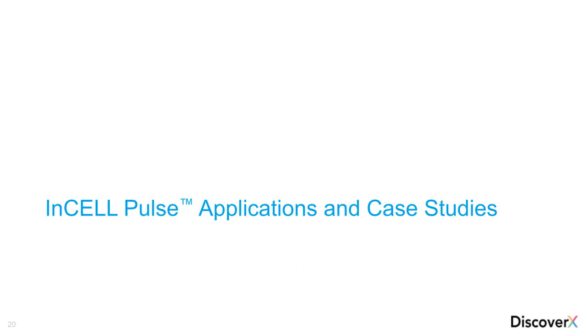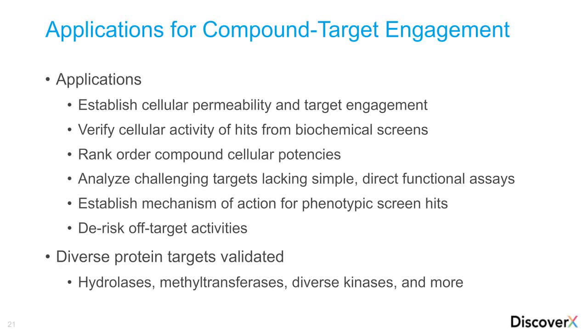The post-denaturation step for this specific target was about 2.5 minutes long at 48 degrees. So that was the condition used for this control. All right, now I'm going to move into the last section of the talk. This is the application and case study section.